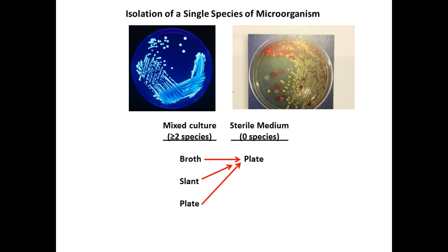Dried out, but still got quite a bit of moisture in it for this skin though. Usually the starting plates that you guys have are streak plates. But remember I said about bacteria not always cooperating? That's an example of non-cooperation, right? Because we're lucky we have growth on those plates. I don't think any of them ended up looking like a streak plate like this one.